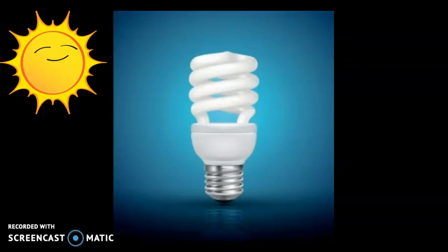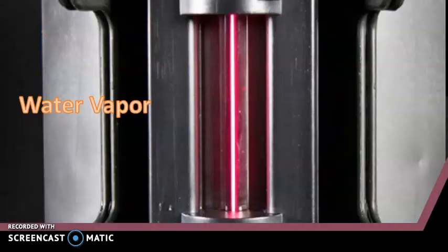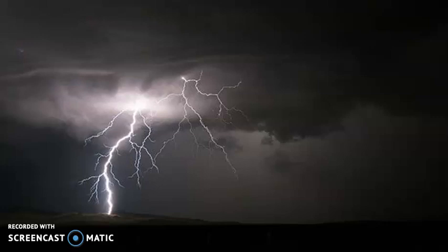Here's another one of interest. This is water vapor. Water vapor kind of has this purpley violet undertone. I know this image looks more red, but it's more purpley violet. It's not bright, but it's still there. So now I want you to think about lightning. Now, lightning is electrons moving or electricity moving through the atmosphere. That could potentially spur some electron excitation.